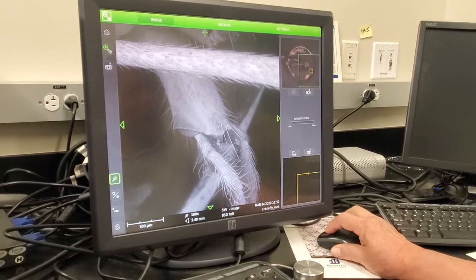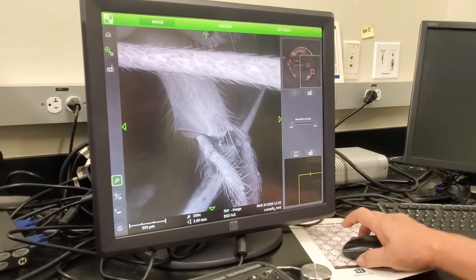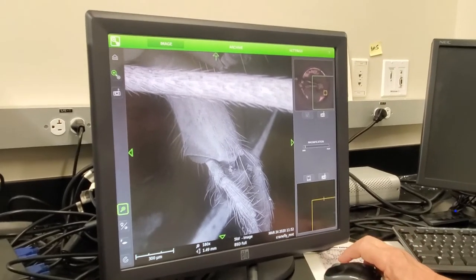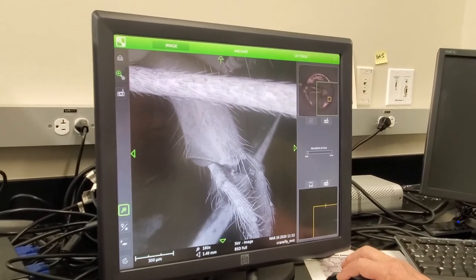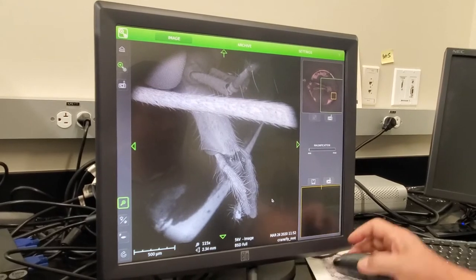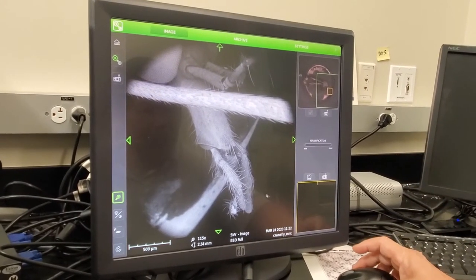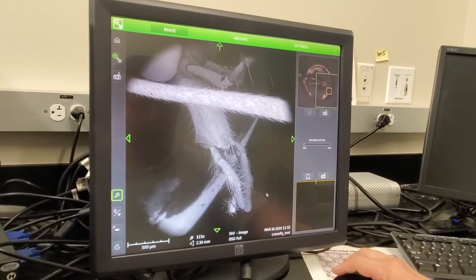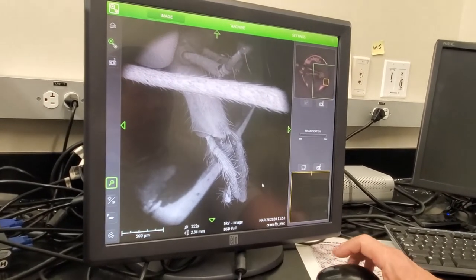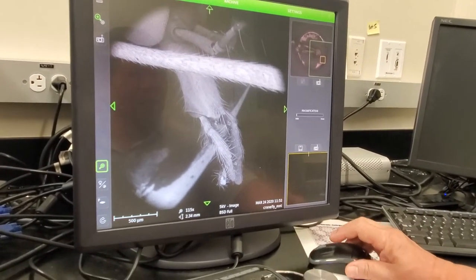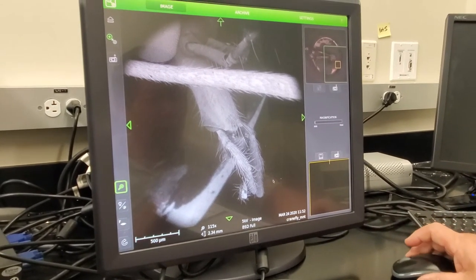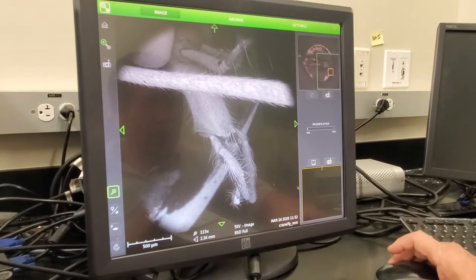What's going on here? It's misbehaving. The mouse is a little screwy — can't move it. Looks like an issue at this point. The mouse is acting a little strange.